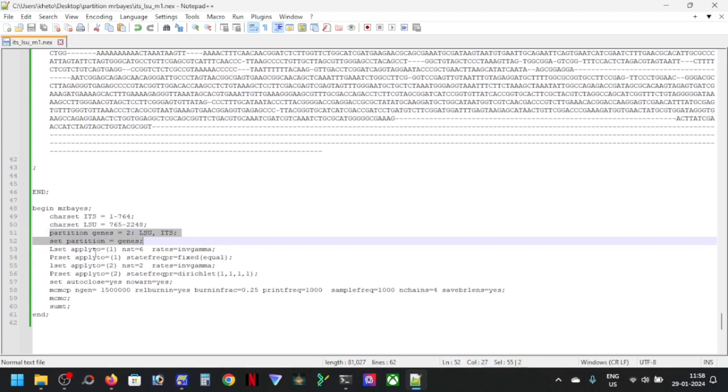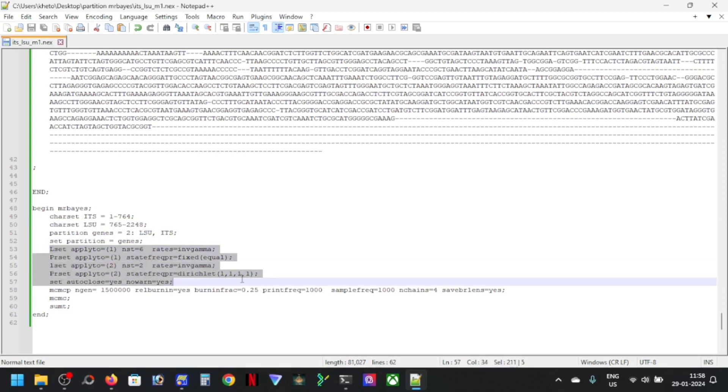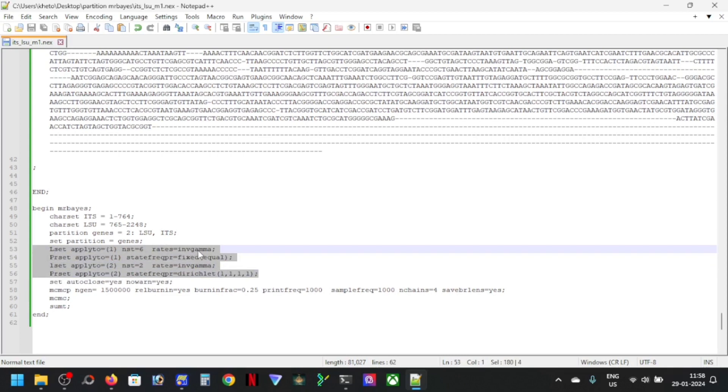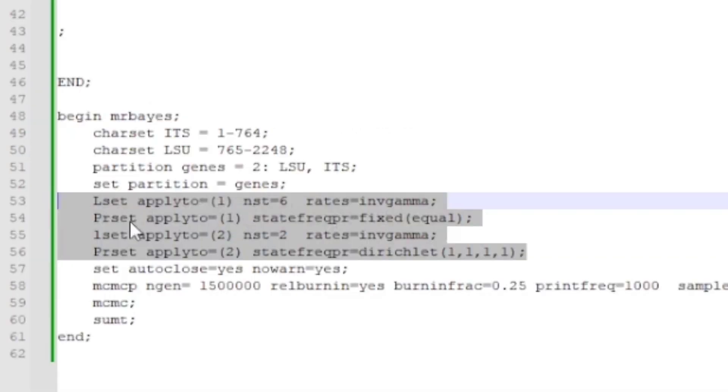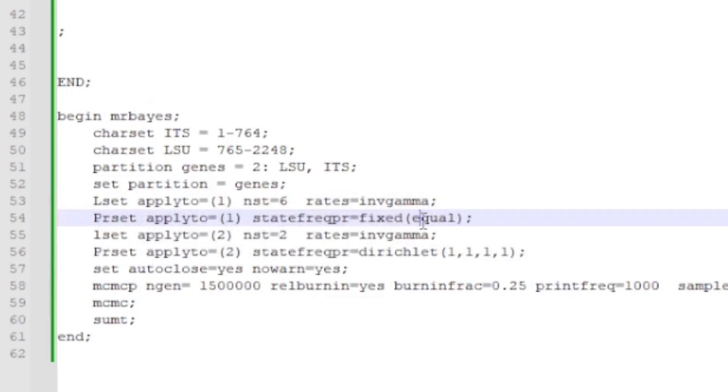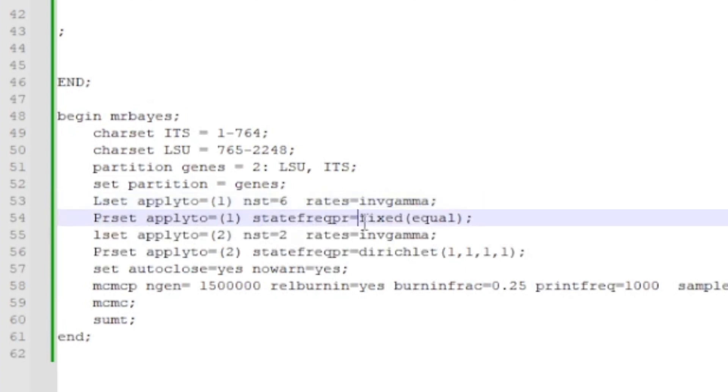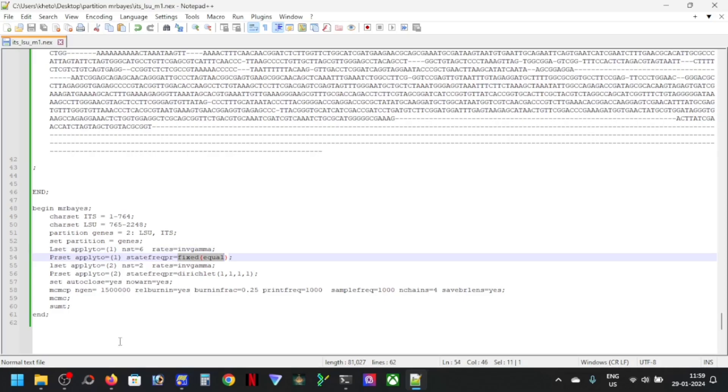And so this part is very important, this portion. You can see here, this is the L set applied to, nst=6 rates equals INV gamma, Prset applyto one, state frequency fixed equal. So this is a model, specifically this nst=6, INV gamma, and state frequency preset fixed equal.